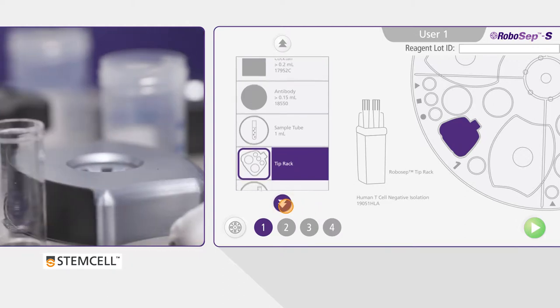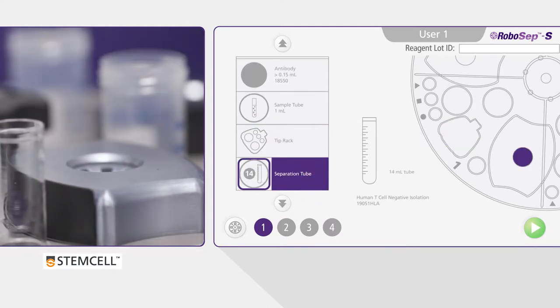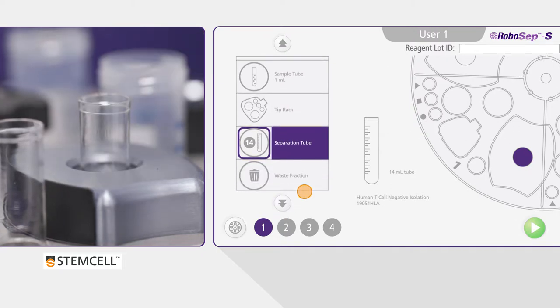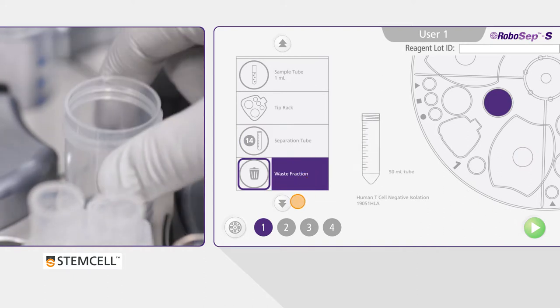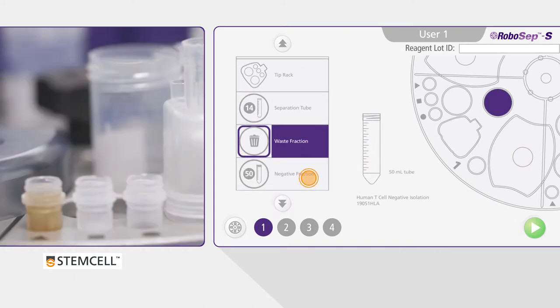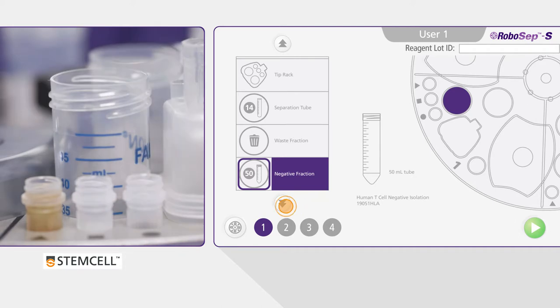Keep following the on-screen prompts and load the separation tube into the magnet. Ensure it's fully inserted and the bottom is touching the carousel. Load the waste fraction 50 milliliter tube. Load the 50 milliliter negative fraction tube.